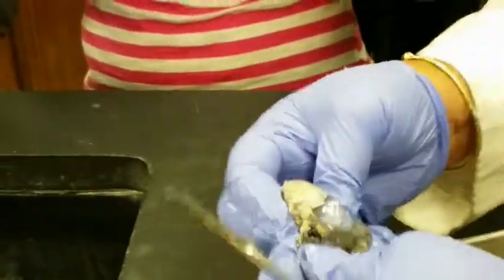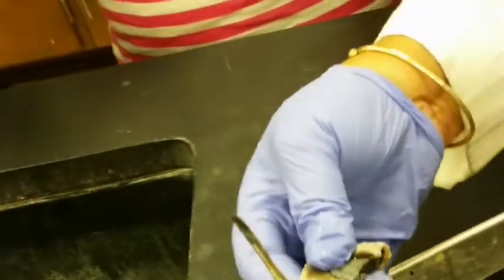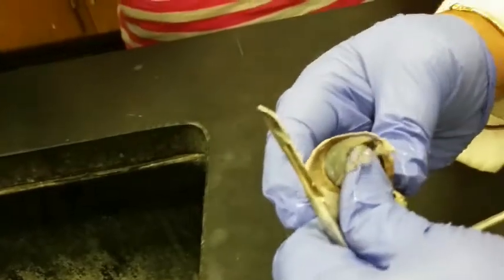And now you tell me, what is this? That's still the aqueous humor. What is this now? Vitreous. The jelly-like substance is the vitreous humor that is represented by that plastic ball, right? So the jelly-like substance that I'm popping out now, that's the vitreous humor.